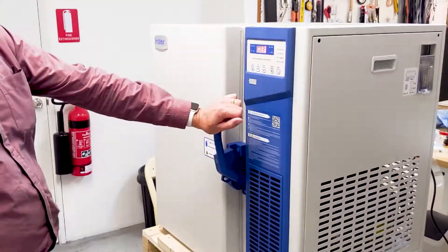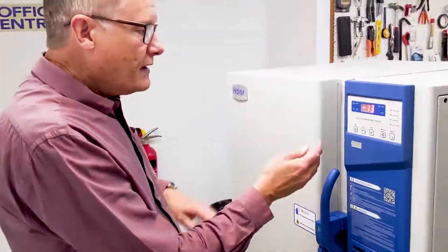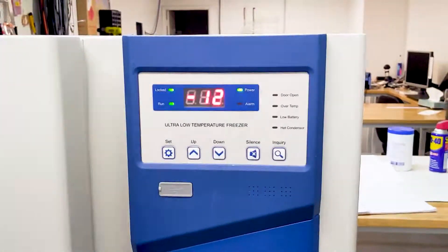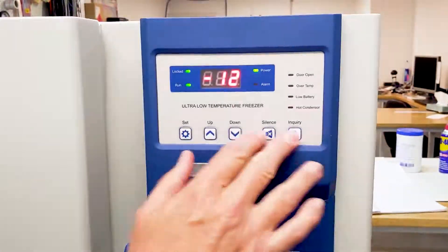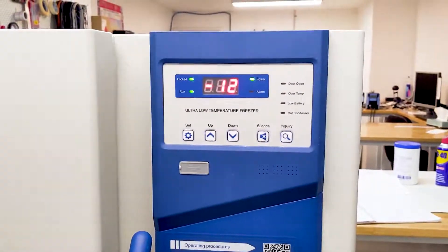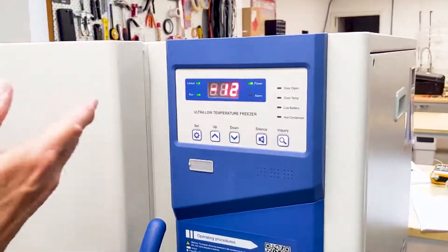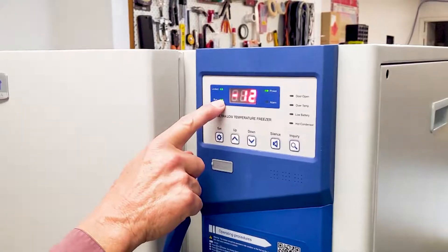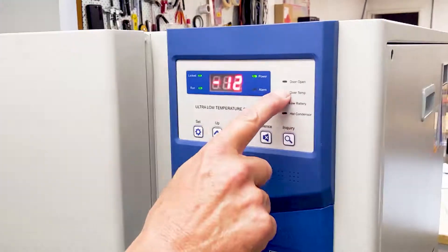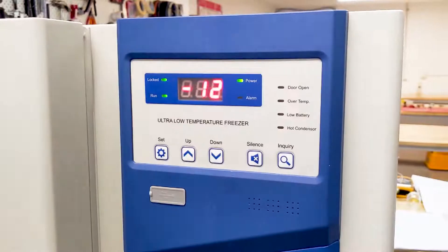It's very simple to operate. You can see on the display here — currently it's got the locked light illuminated, which locks off any of the buttons from working and prevents inadvertently changing any settings. It also displays the current working temperature, the fact that it's running, that power is available, and that there are no alarm conditions currently operating.